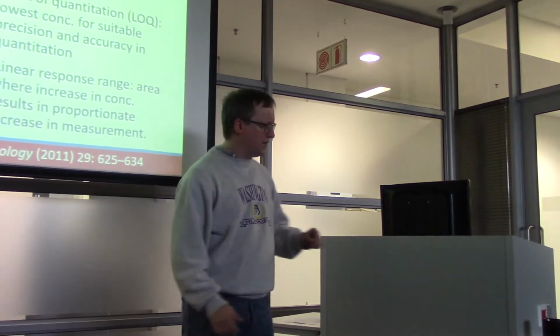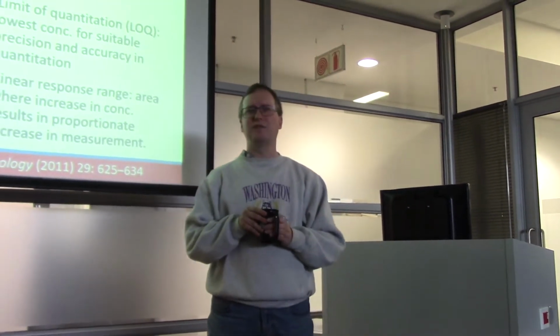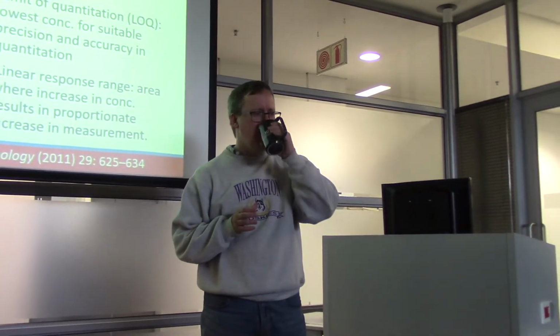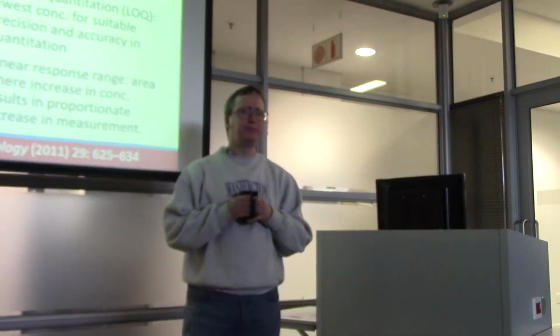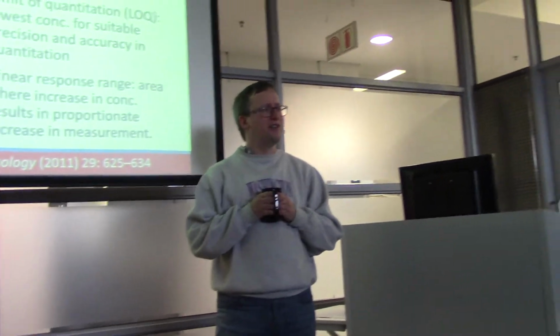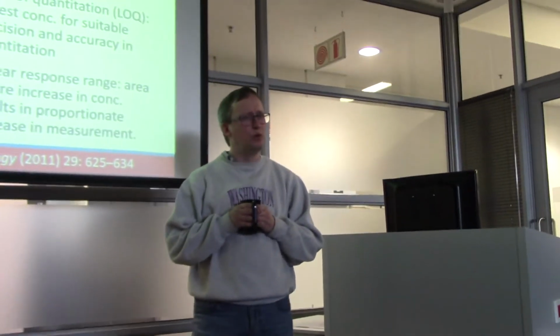Now, I understand that you've observed calibration curves before, but I just feel like we have to mention it any time the subject of quantitation comes up. A calibration curve happens because our researchers are not interested in mass spectrometric intensity. The mass spec is a tool, right?